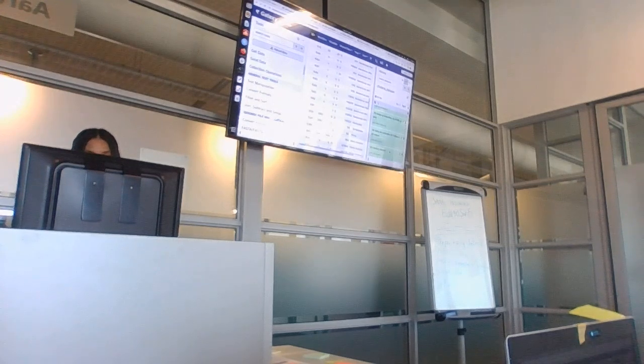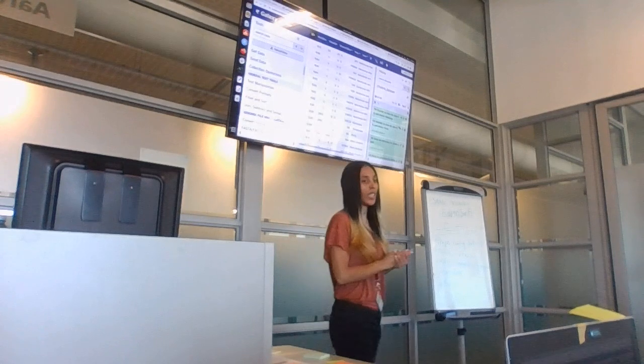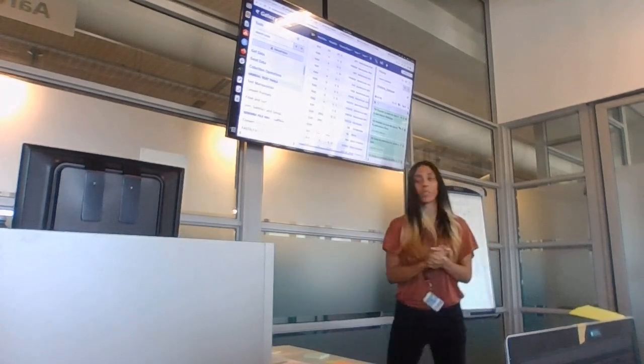Remember, it's already in this dataset. Are you guys following what I'm saying? Yeah. Is it okay? Okay. This last one that you uploaded, delete that one because it doesn't belong with that dataset. It was just used for demonstration purposes.